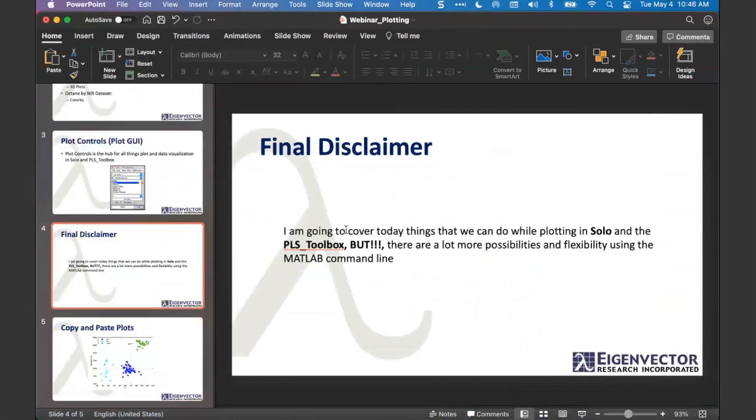I have actually done quite a bit of creating my own color maps for things, but I wind up having to apply them from the command line. They don't register, they don't wind up in the list of things when you click on the color bar. Right. Yeah, and that's a great point.